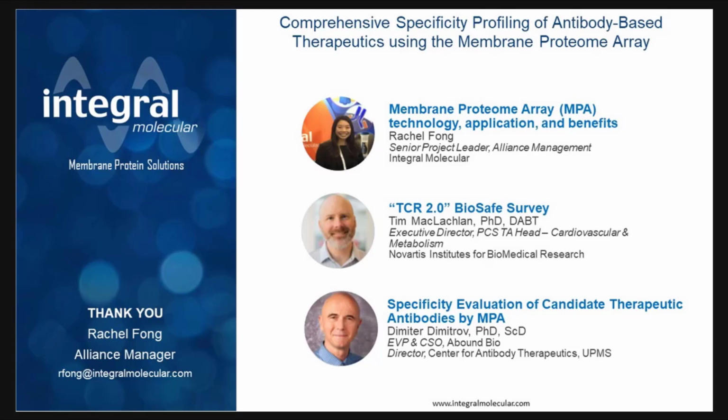And to be honest with you, that's kind of why we initiated this survey in the first place regarding alternatives, because we feel that these array screens, while they don't tell you where, the question of what your antibody is binding to seems to be much, much more valuable than the where sometimes. Yes, I think that this data of the what could potentially really mitigate some of these regulatory concerns when they crop up.